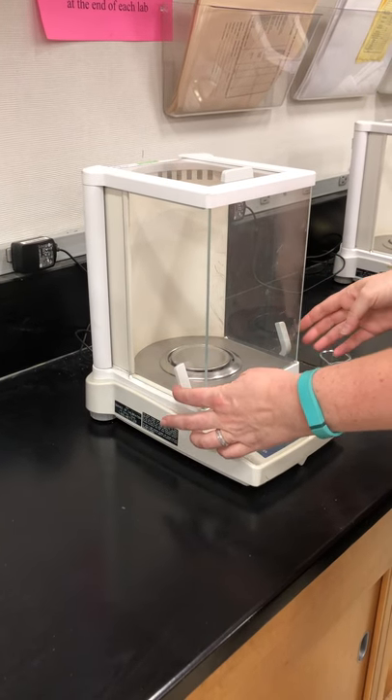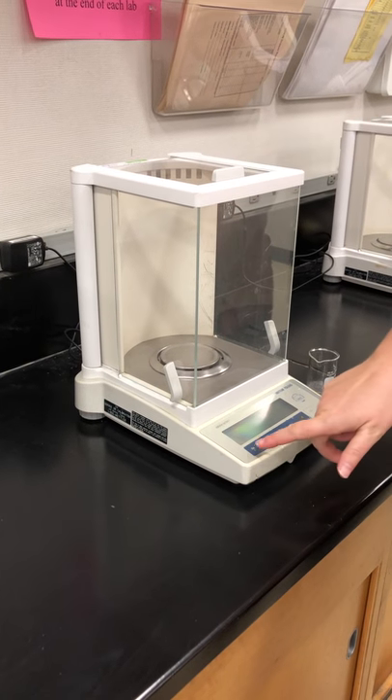Make sure all three doors are closed — the two on the sides and the one on the top — and then turn the balance on.